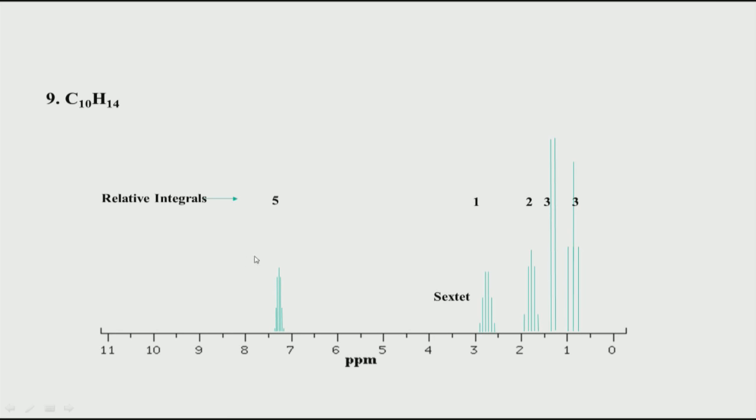So what typically we do is bunch all the aromatics together and get a common integral value for that. The presence of these peaks already tells us there is an aromatic system, plus the integral under them together gives the total relative integration value, and that tells me that there are 5 protons. So essentially it means there is a phenyl ring, the benzene, the phenyl group, and that is why there are 5 hydrogens. That is how we interpret this side.